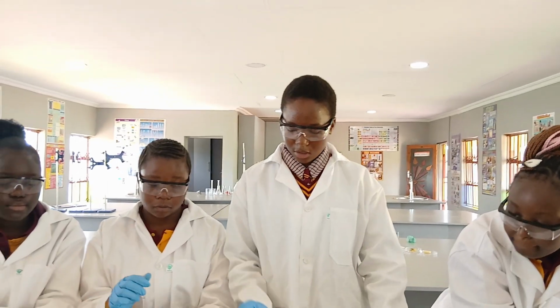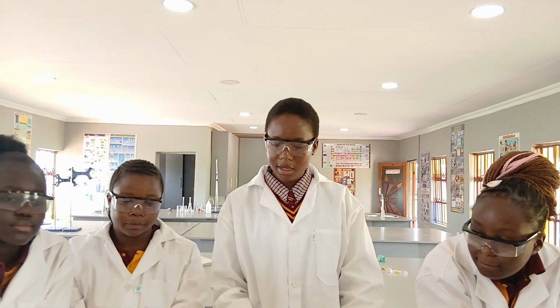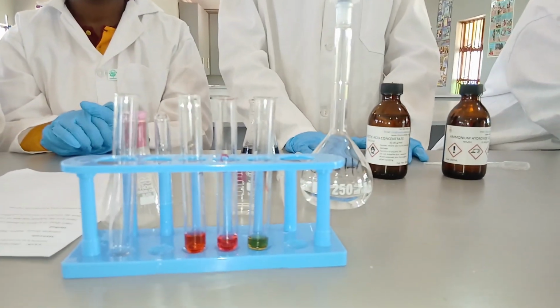So in conclusion, we can say that the indicator that we have made using hibiscus flower is potent, and I highly recommend using hibiscus flower to prepare your own acid and base indicator because it's much more affordable and cheaper.